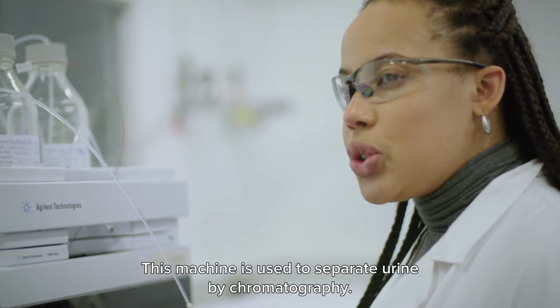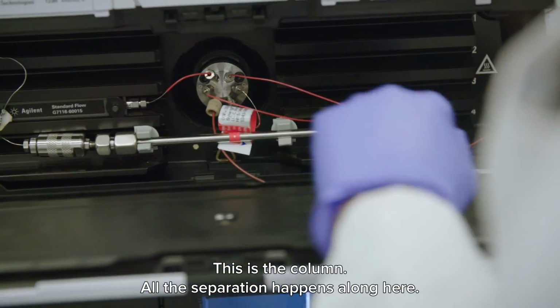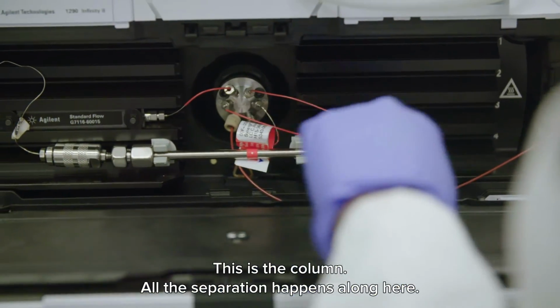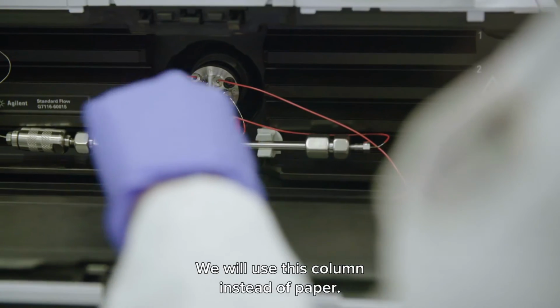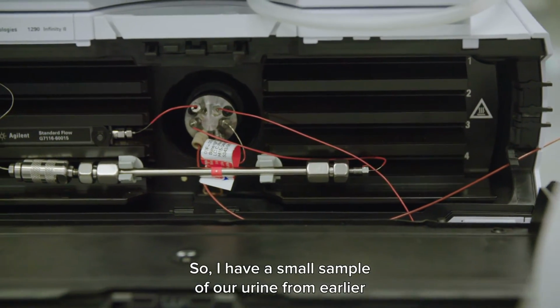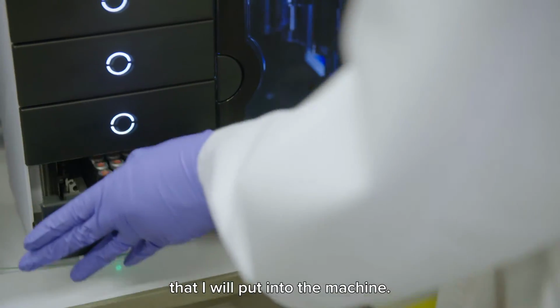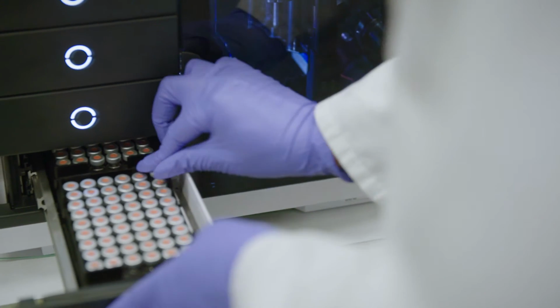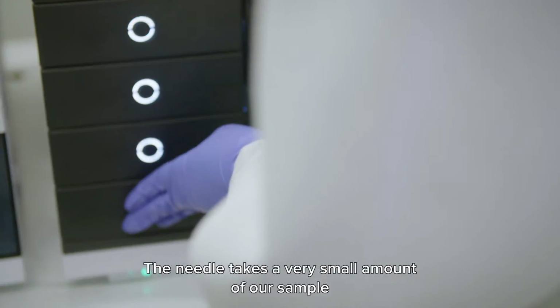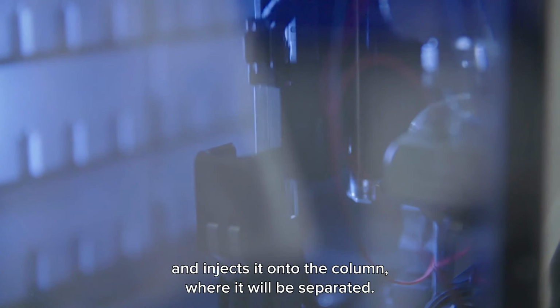This machine is used to separate urine by chromatography. This is the column, and all the separation happens along here. We will use this column instead of paper. So I have a small sample of our urine from earlier that I will put into the machine. The needle takes a very small amount of our sample and injects it onto the column where it will be separated.